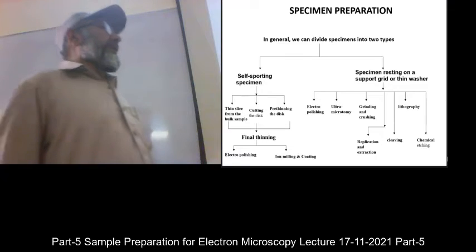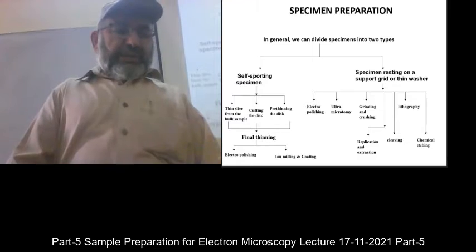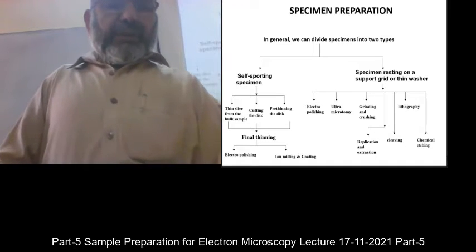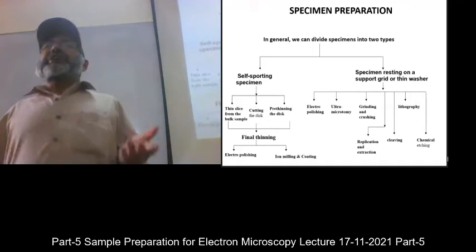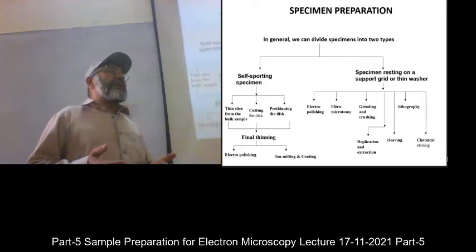Specimen preparation, the significance of specimen preparation, I have explained it, that it is very important in every material and for each and every technique.